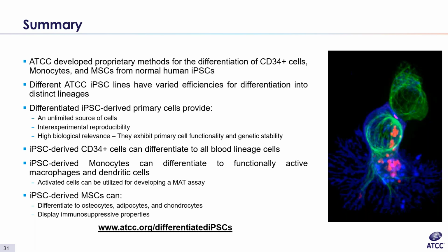Now, here are a few questions that all came in from the same asker. Are monocytes mostly suspension cells compared to macrophages? Besides the markers, is it possible to differentiate between monocyte stage and macrophage stage morphologically and based on adherence? And can we consider activated monocytes to be macrophages when they become adherent and polymorph?